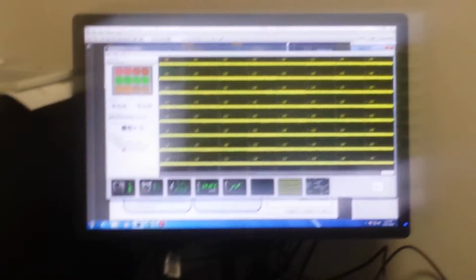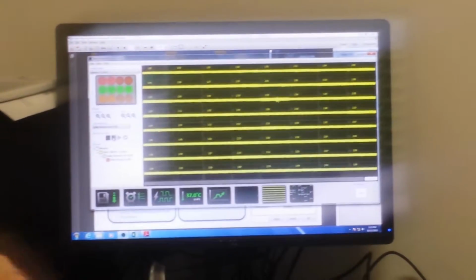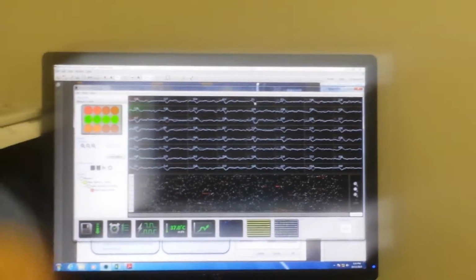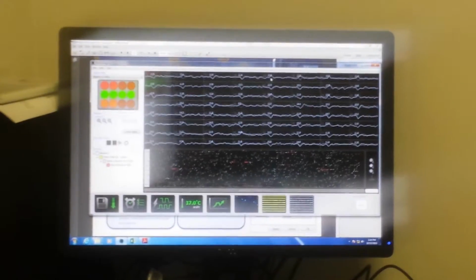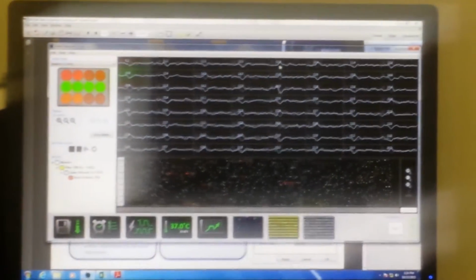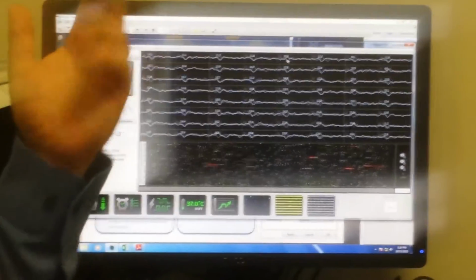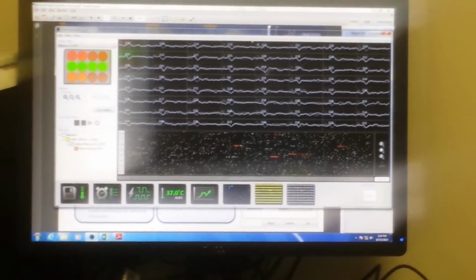In general, we recommend 6. Sometimes if you have smaller amplitudes, people will go down to 5.5. But you'll start to see some false positives ramping. You'll have equal positive and negative peaks. Whereas when you have a true signal, you've got a very reproducible waveform coming through. It's not always perfectly reproducible. Sometimes you'll have multiple active neurons and they'll each have their own waveform. So that's where you get your principal component analysis and start to separate those out.